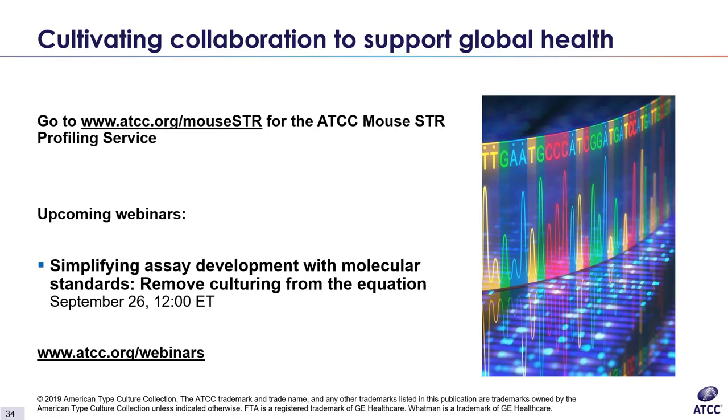The key to testing when it's a non-ATCC cell line is to authenticate as soon as possible and before you begin using the cell line in your study. The profile generated early on will essentially establish the cell line's baseline profile. So this baseline or reference will be the profile for your starting material. As you go through your research and authenticate at the key points that I discussed, this will allow you to check that the cell line matches your starting material throughout your study, and therefore identify any contamination or misidentification. Great answer.